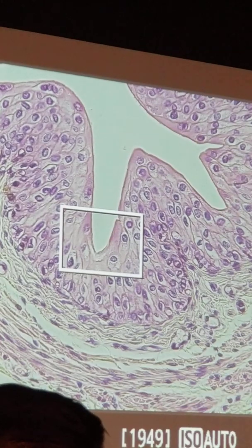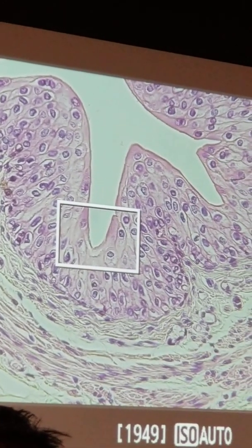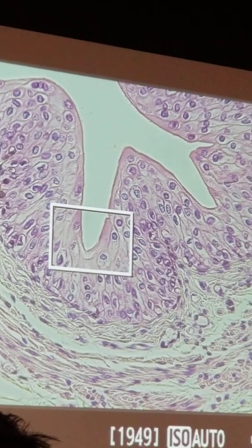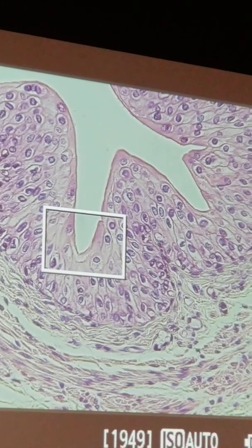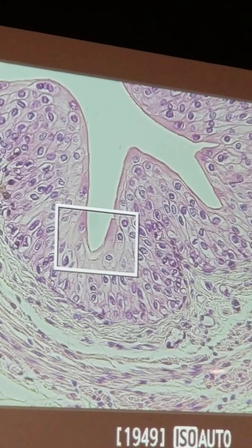And by the way, in this one here, if you look under there, it says lamina propria. Next to that, just put CT, because lamina propria is the what? Connective tissue. Also says lamina propria down, pseudostratified, put CT next to that so you don't forget. So there's my basal surface or basement membrane and the connective tissue right underneath it. Okay, the lamina.